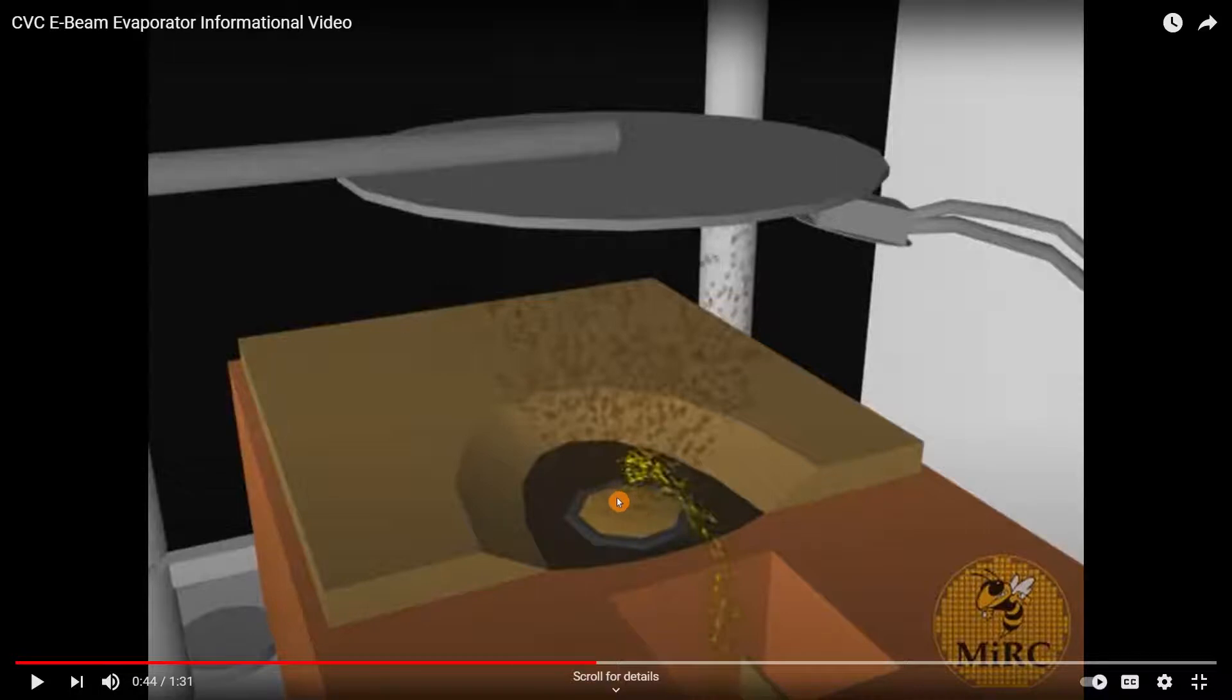And the source material, under the heat, becomes vapor and condenses, going up to the substrate and becoming the film.